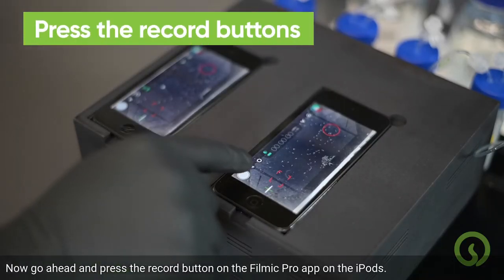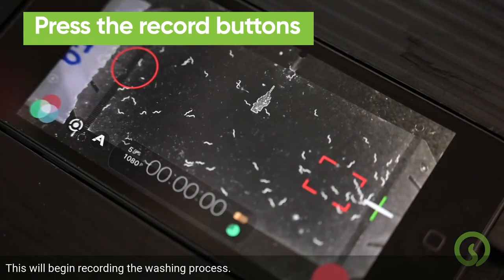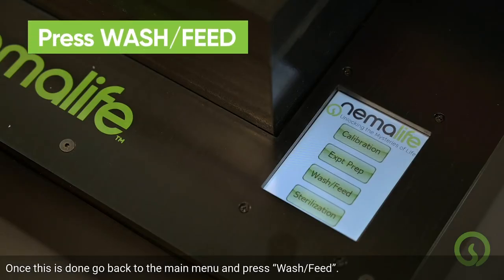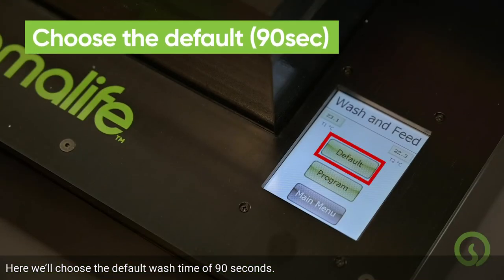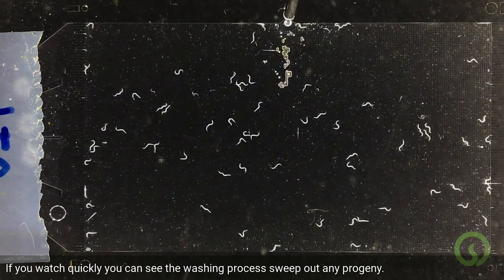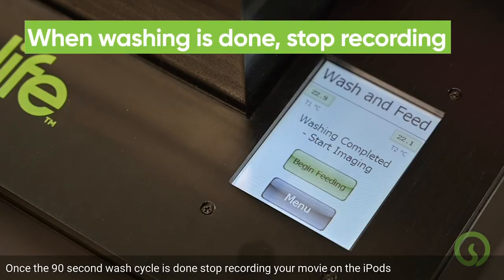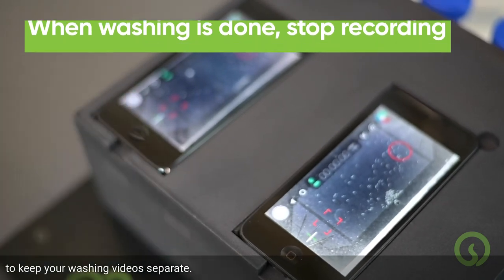Press the record button on the FiLMiC Pro app on the iPods to begin recording the washing process. Then go back to the main menu and press Wash Feed. Choose the default wash time of 90 seconds. You can watch the washing process sweep out any progeny. Once the 90-second wash cycle is done, stop recording your movie on the iPods to keep your washing videos separate.